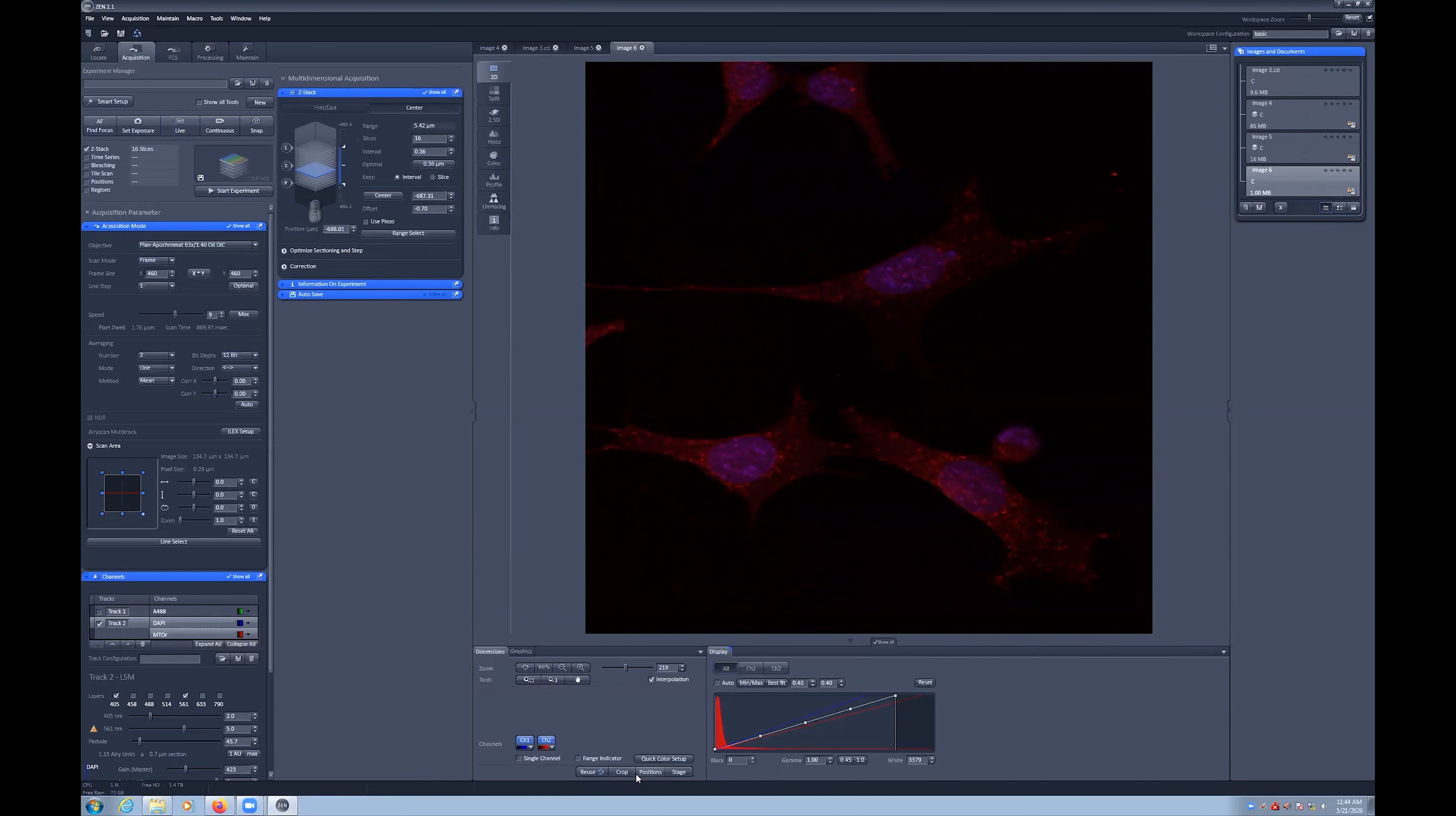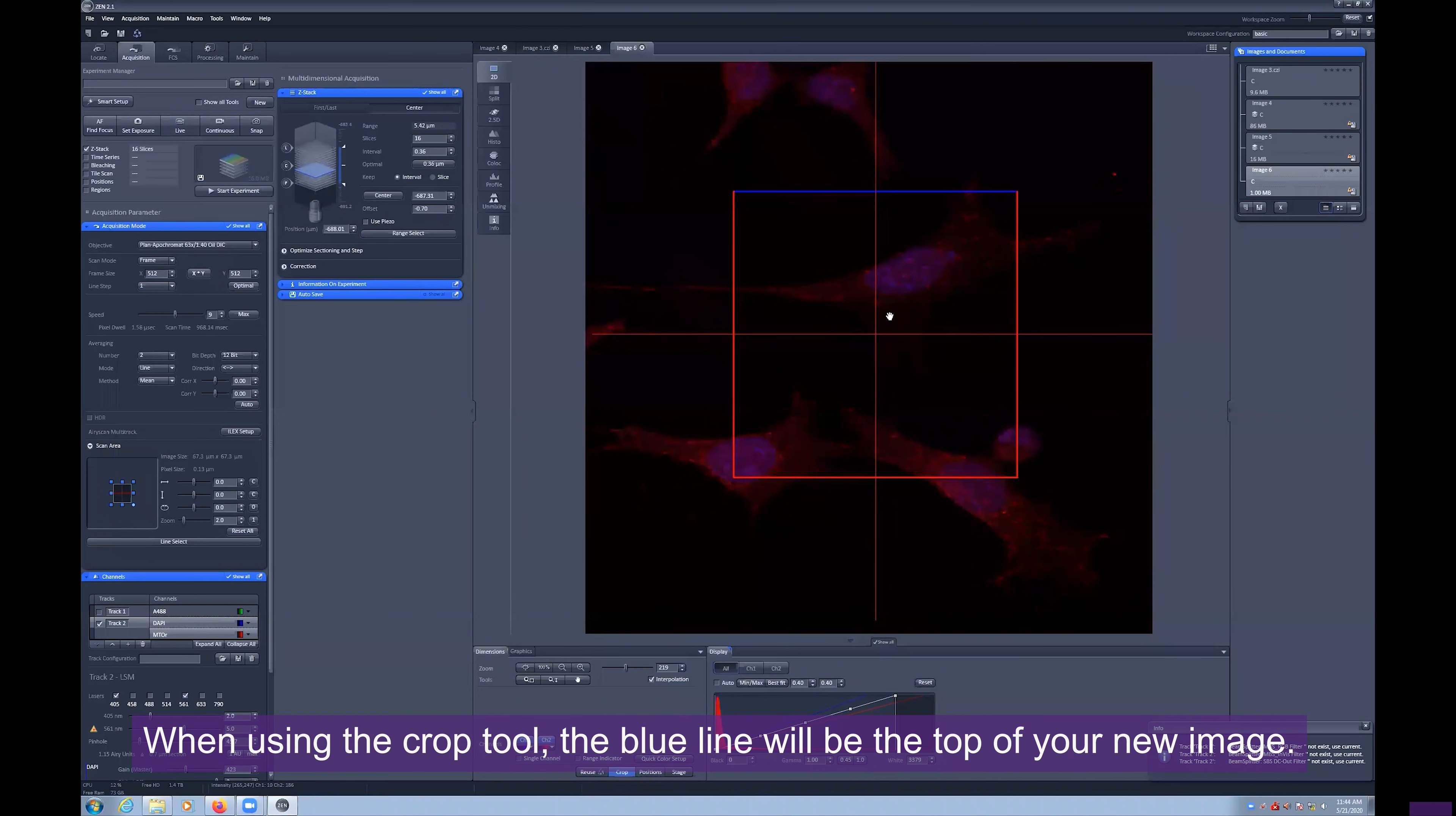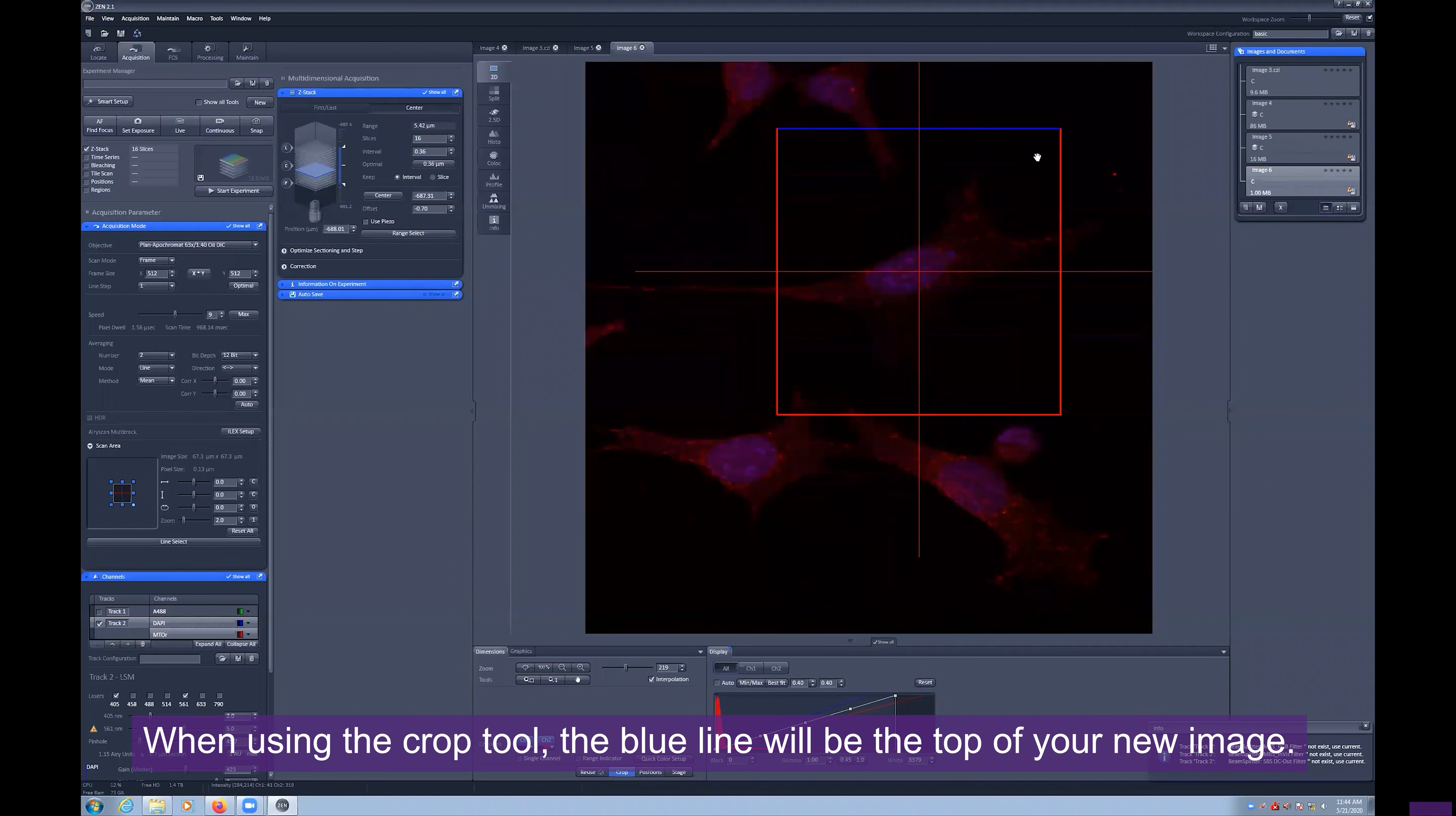Using the Crop tool located at the bottom of the window, we can resize and rotate the field of view.